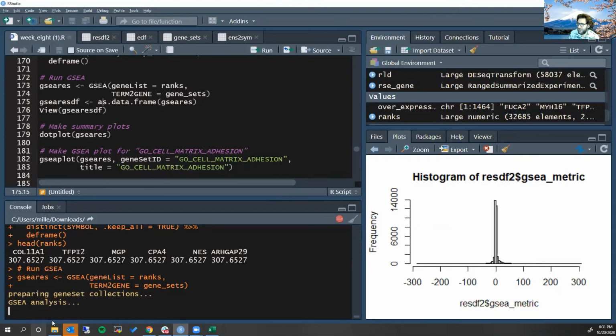If anyone wants to know how the math here is working, you can find the 2005 paper. That's on the website where I was getting the MSigDB. And if anyone is interested in learning about the math behind this and other similar methods, like the KS tests, which are a family of similar statistical approaches, I'm pretty sure Dr. Chen goes over that in his lectures. Just something to read while you're waiting for your program.